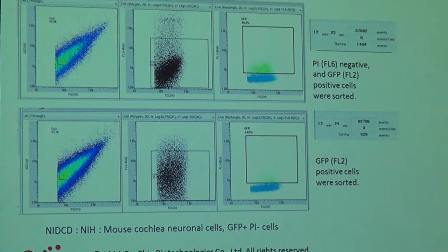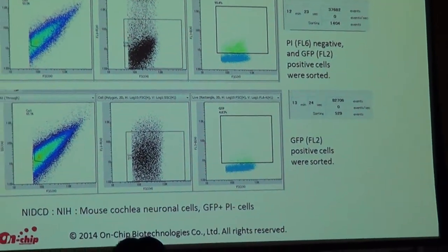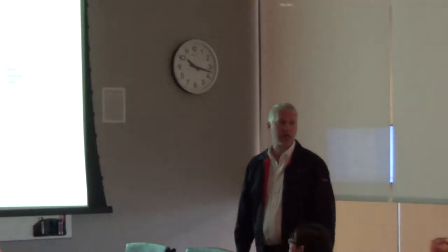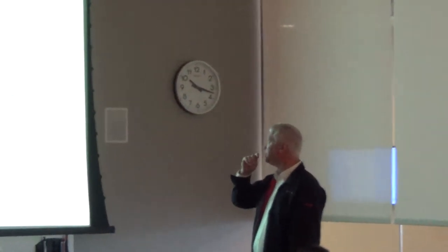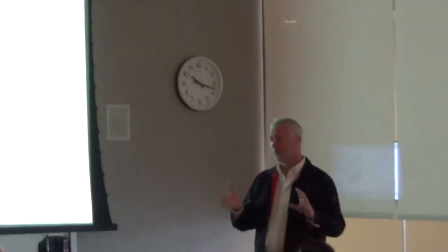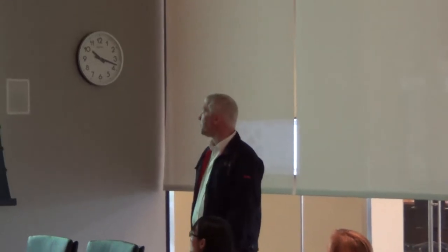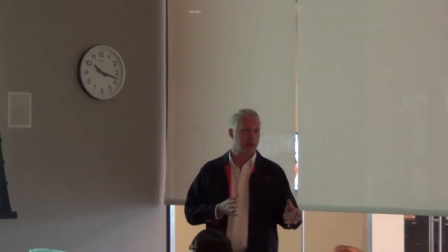This was one of the sorts that we did with the Kelly lab, which is a little bit similar to what Ken's looking at with mouse cochlea neuronal cells. This group worked with adult or very young mice, and the challenges on either one are in terms of sample recovery. These guys were also pretty obsessed with getting damage-free, clean samples into their C1 or RNA-seq.